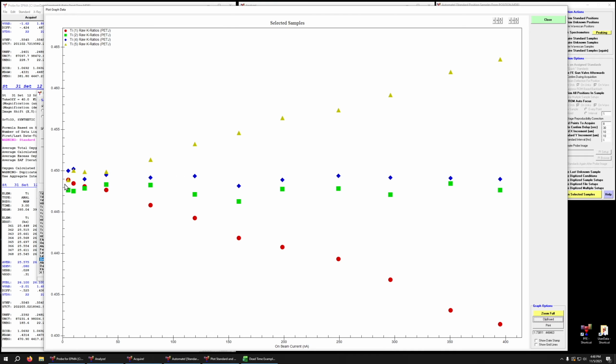We're talking maybe 2 in 450. So pretty small amounts versus spectrometer 1 and spectrometer 5. These clearly are varying with count rate pretty systematically. And again, this is a dead time issue. I intentionally put an incorrect dead time in here. And in the case of spectrometer 5, you can see that as count rates go up, we're getting more counts than we should. So this means our dead time is too low. We are overcompensating for the dead time, and we have a dead time value that is too small.